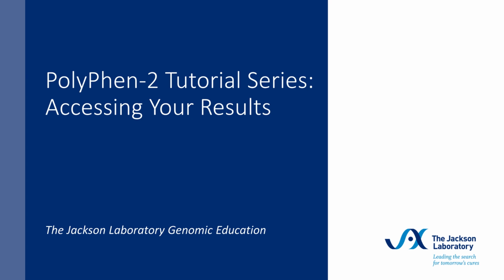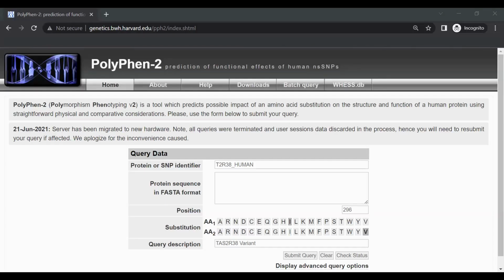This short video will demonstrate how to track your submission progress and access your results through the Grid Gateway interface page. We will begin on the home page of PolyPhen-2.